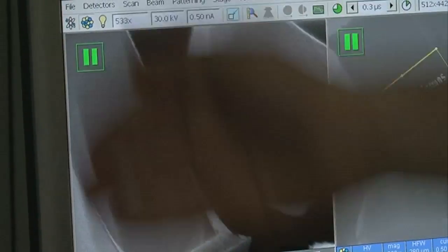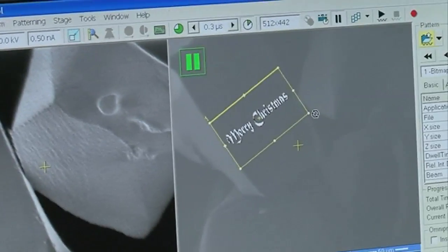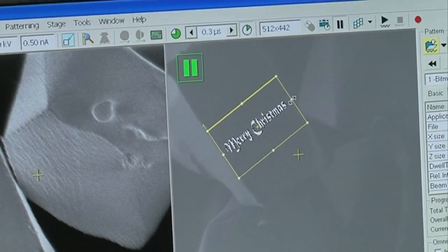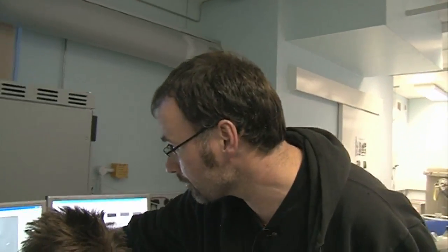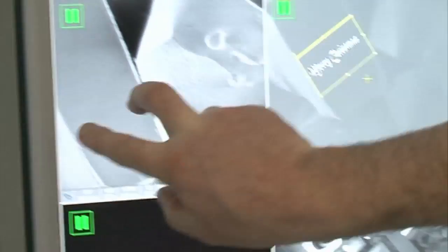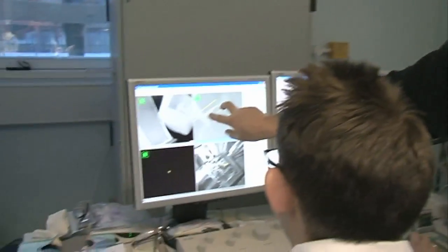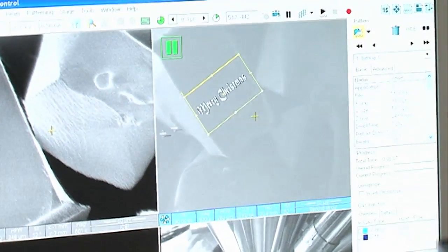What Chris is going to do is write a wonderful Christmas greeting on the end of one of these facets. He's going to use focused ion beam to do that. This facet here is about 50 microns across, roughly the width of a hair, and he's going to write that directly on the end of this snowflake.